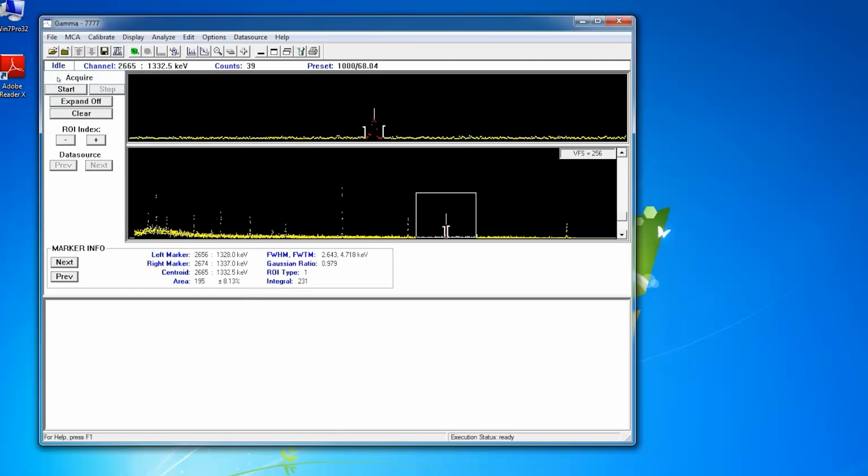This concludes our video demonstration on how to perform a detector gain adjustment in Genie 2000.